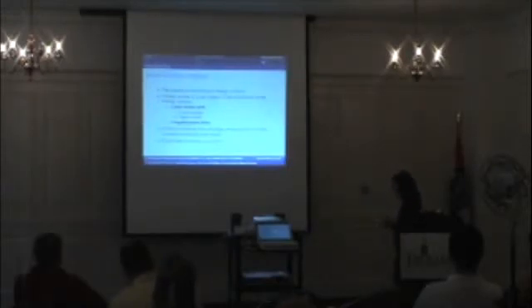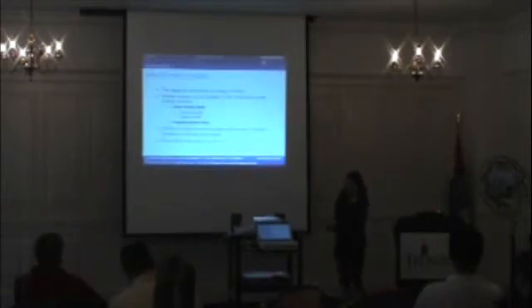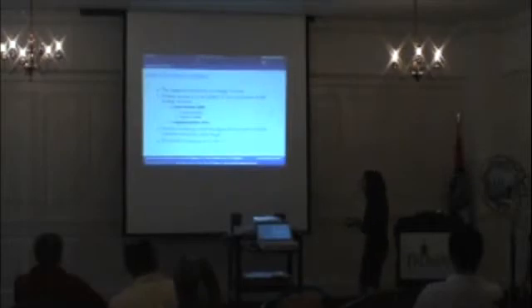A few other problems that we commonly run into with active contour-based methods are deciding when to stop evolving the curve. It's a parameter that the programmer has to come up with for when it's a good time to stop. If you don't match that correctly, then you'll miss your boundary and you have error there.